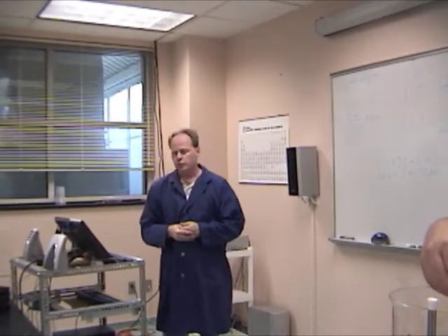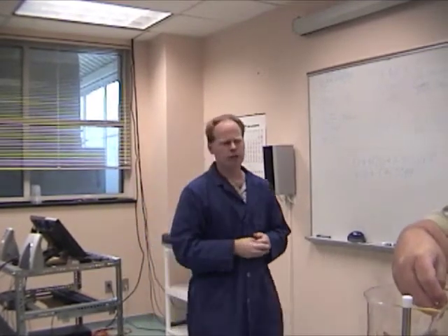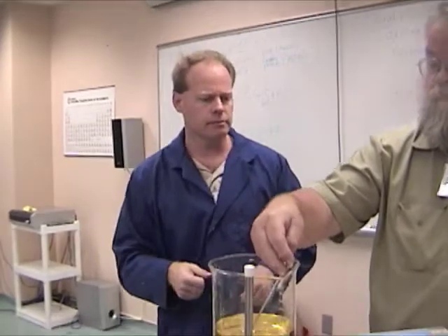So, first thing we're going to do is dissolve some catalyst into some methanol. To do that, I need to weigh out some sample here.